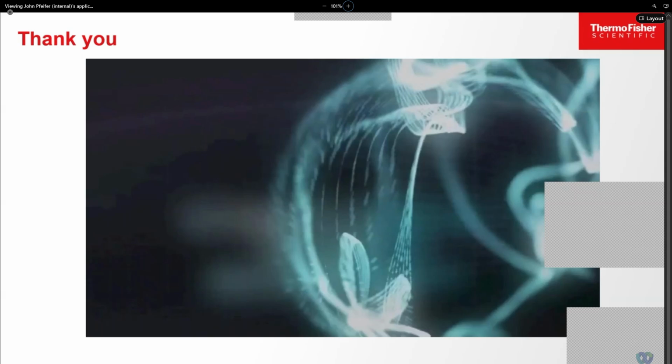Oh, here we go. Okay, so the question is, which application in particular has Thermo Fisher applied this method, sorry, 5-nuclease assay? Is contamination an issue? Okay, that's a very interesting question. We have many real-time PCR applications, all using the 5-nuclease assay, or TaqMan. A lot of people like to call it that.